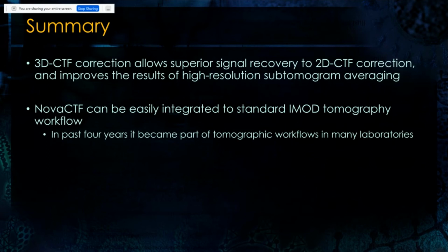And in the past 4 years, we use it normally now routinely for all the subtomogram averaging projects. I think that people from John Briggs' lab also still stick to this one. Might change now with new Relion, but let's see. And I know that in the past 4 years, I got many requests for help, and in the end, many positive feedback from many laboratories that actually managed to improve the resolution while using novaCTF. So I hope it will still remain that way.